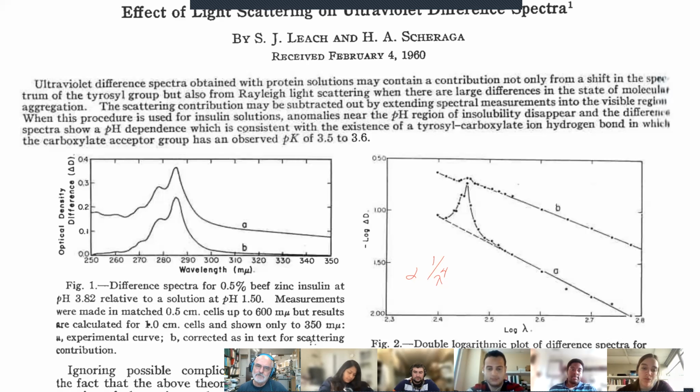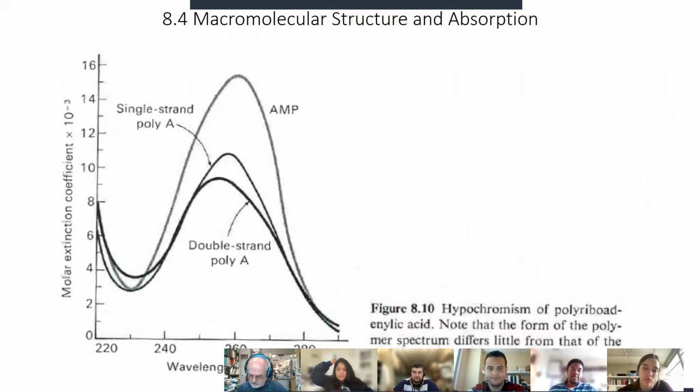So I've given you a spectra in the assignment of one of her samples that has light scattering in it, and I'm asking you to correct for it. This is the method. I've outlined it for you. The paper is only about 3 or 4 pages long. It has some other details in it that may or may not help. I think what I showed you is the gist of it.